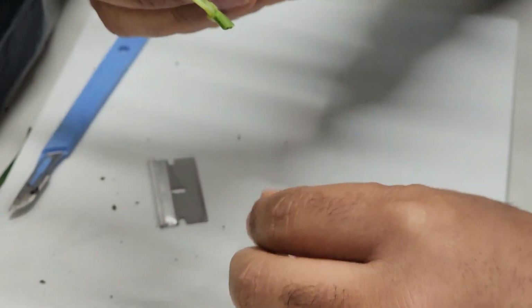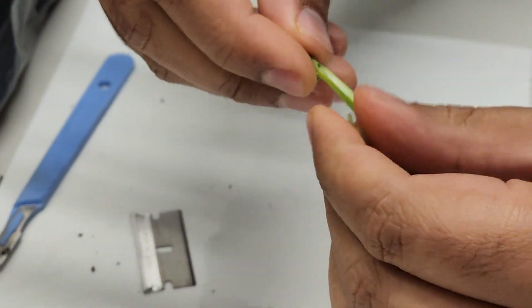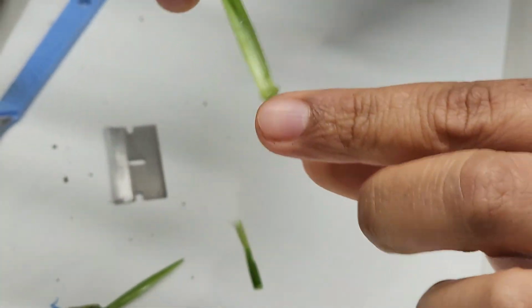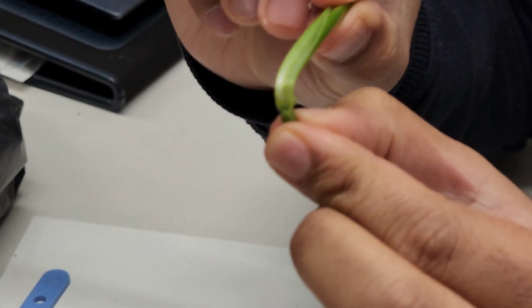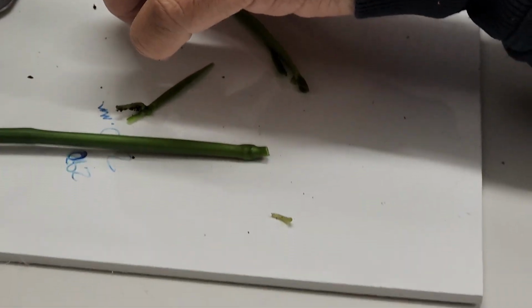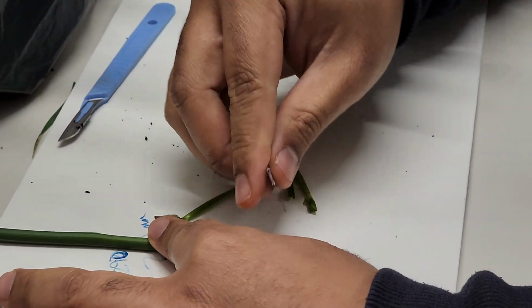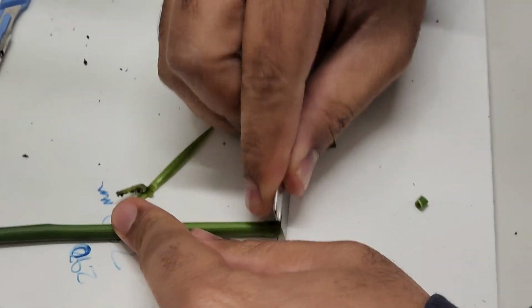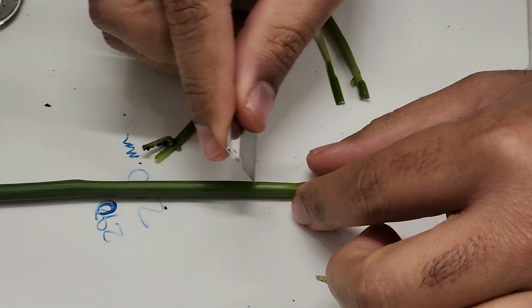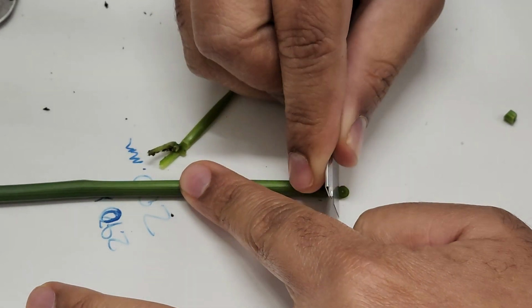Any meristem there? I hope there is no meristem. You see? Is there a meristem? No meristem. Empty. You see? Meaning that the meristem is actually here. Right, so that's what we're going to do. We're going to take some section just above the node here so that we can get the meristematic region.